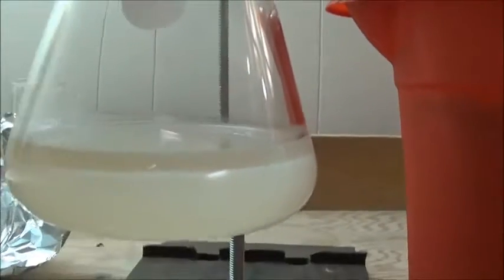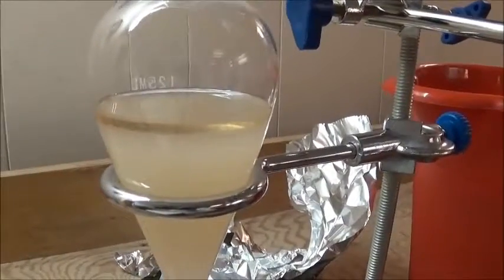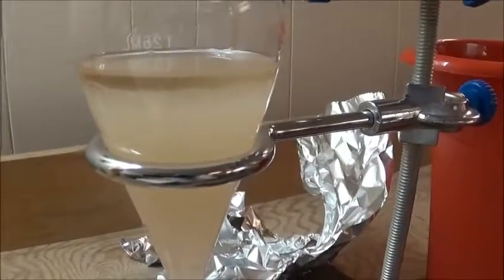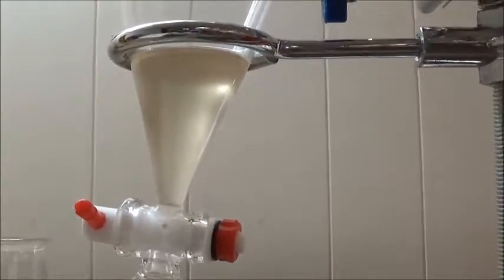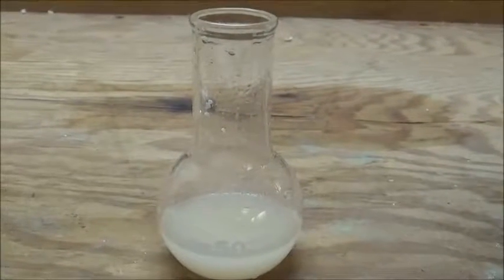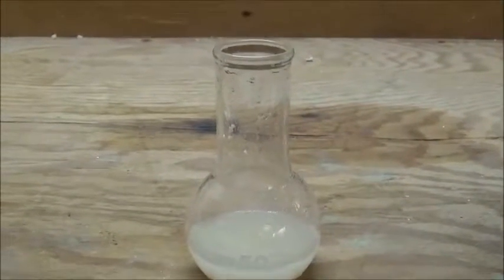Here's the flask — it's cooling right now and it looks like the top layer is the ethyl salicylate. After letting the contents of the flask cool, I transferred everything into the separatory funnel and waited for the layers to separate. I've just separated them — here's the bottom layer and here's the top layer. I've washed the crude product several times with distilled water, twice with sodium bicarbonate solution, and several more times with distilled water.